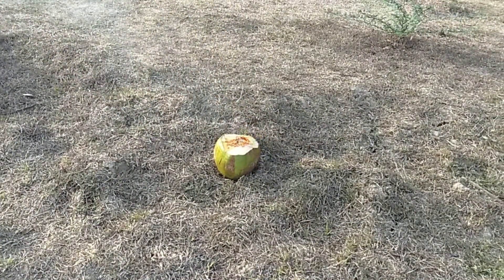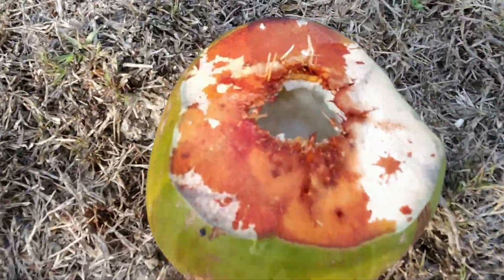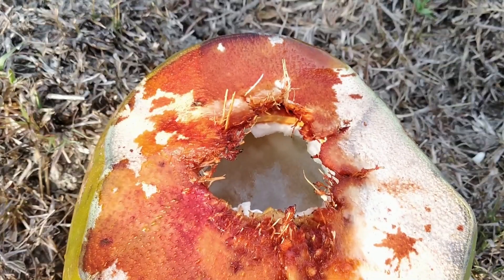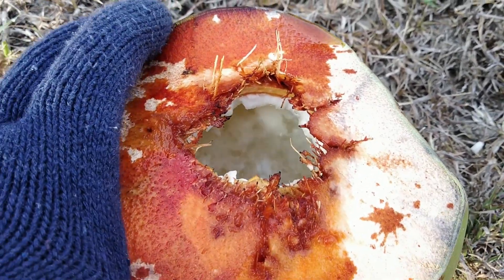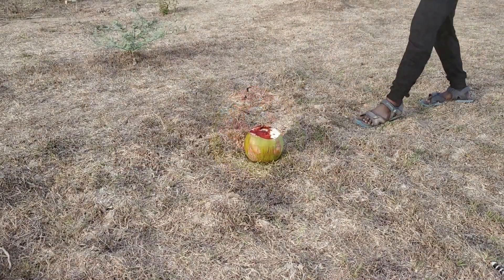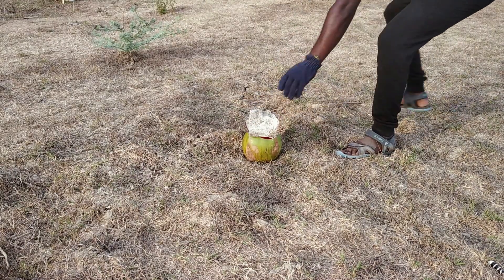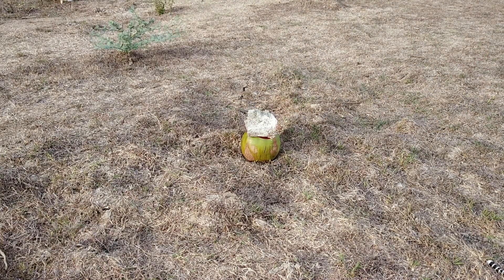If you look at it, you can see it clearly. You can see sodium hydroxide forming as well. Now let's repeat this experiment. You can also see the pressure building up.